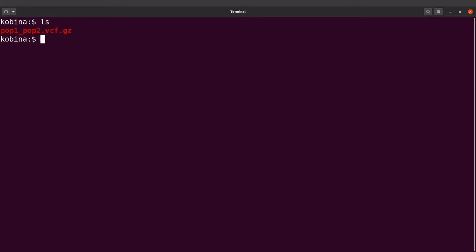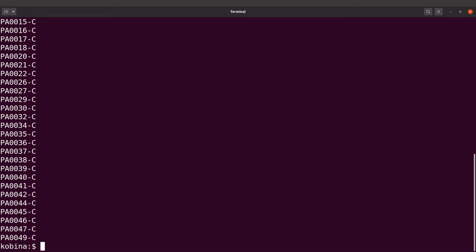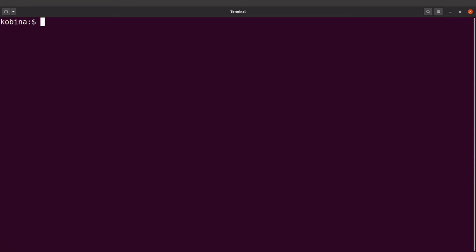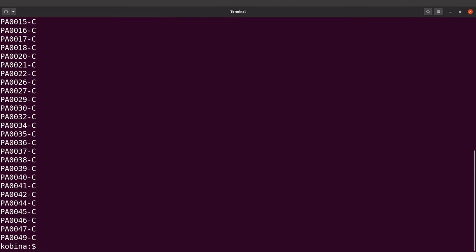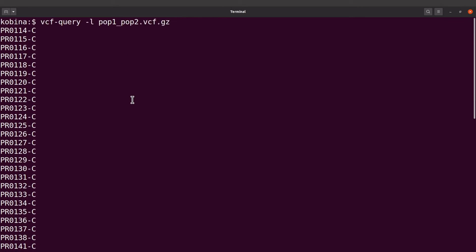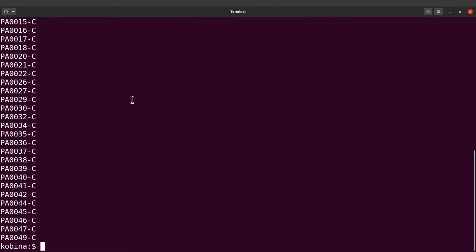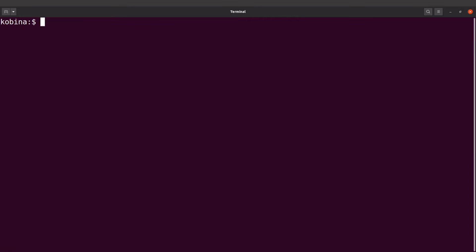Okay so first of all let's look at the samples. To get the samples I say vcf-query dash l and then I'll supply it with a VCF file. So this will list all the samples. Let me just repeat again, I'll say vcf-query dash l and then I supply it with a VCF file, and then I'll execute it.